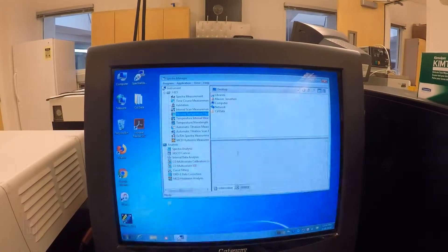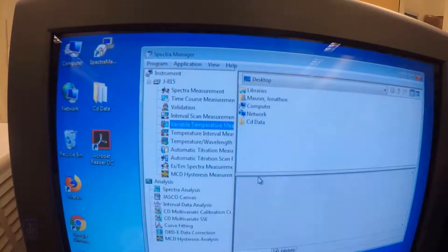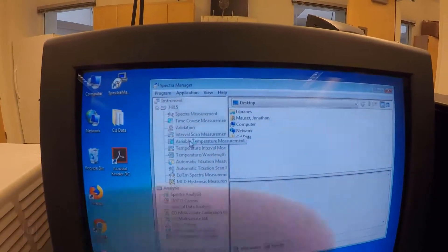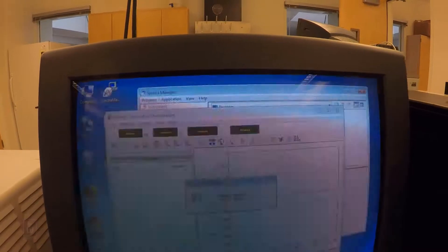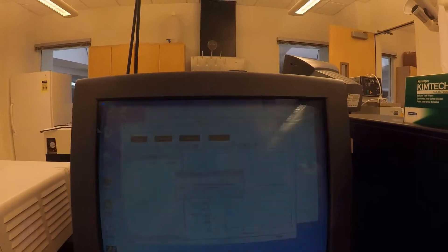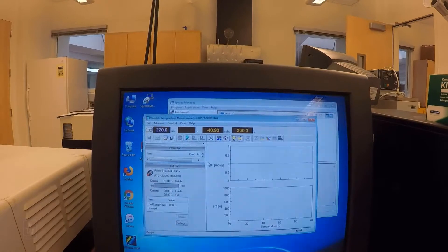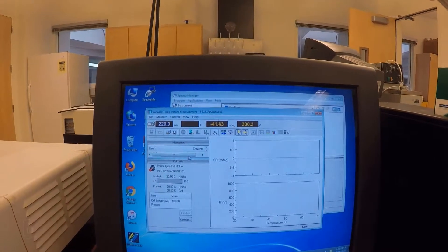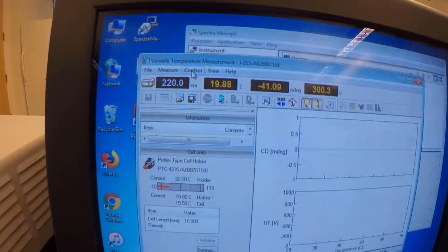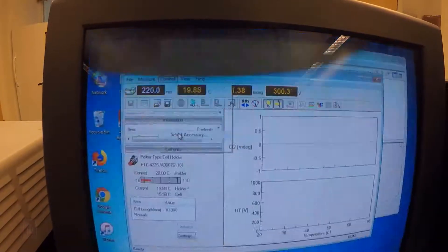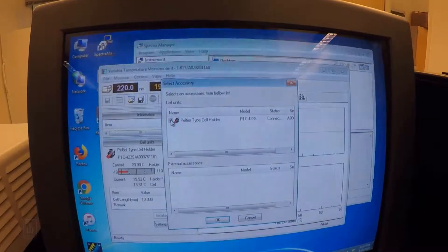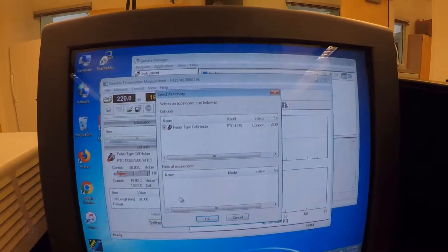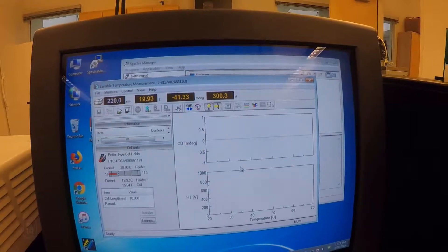What we're going to do next is we're going to do a thermal melt on this BSA to see what its melting point is and observe what's going on with it as it denatures. To do a melt, what we're going to want to do is go to Variable Temperature Measurement here in Spectra Manager. The only thing that might be a little bit weird for you is if the Pell-TA is not connected, it's going to give you an error. If that happens, just go to Control, Select Accessory, and make sure the Pell-TA type cell holder is on, and then it'll connect to it and be okay.